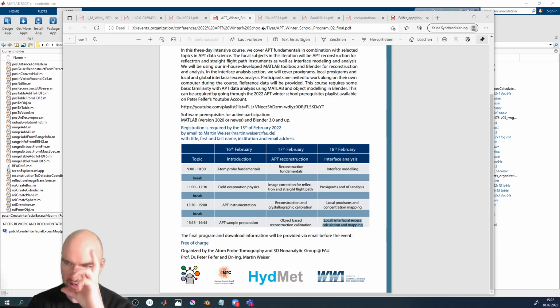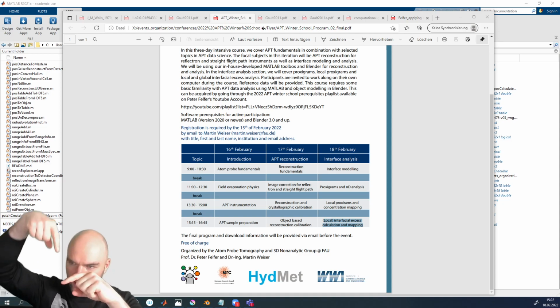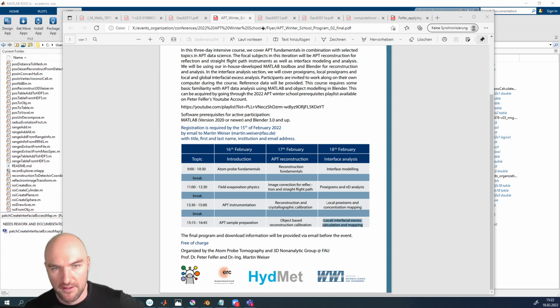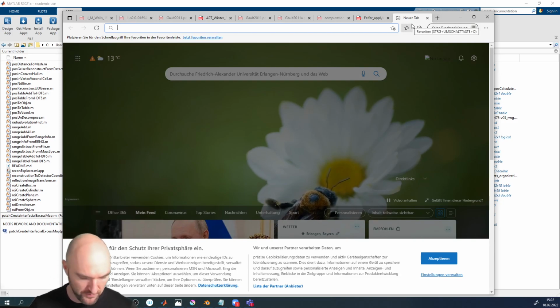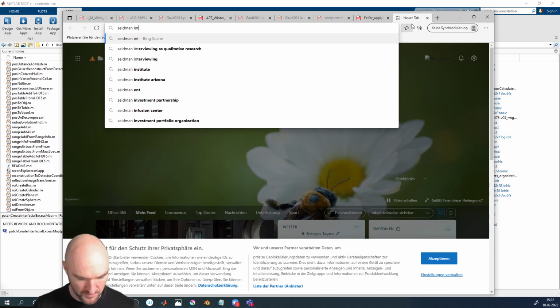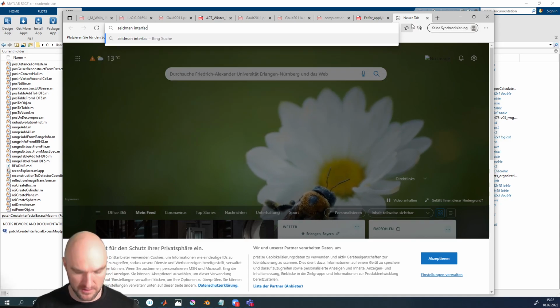The maximum concentration can be very much influenced by the orientation of the interface in our atom probe data set, if we're measuring along, across, or at any angle in between. So we need a bit more robust value, and that's been around in atom probe for a very, very long time.